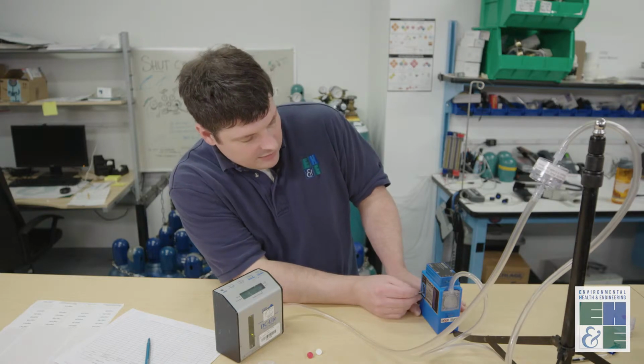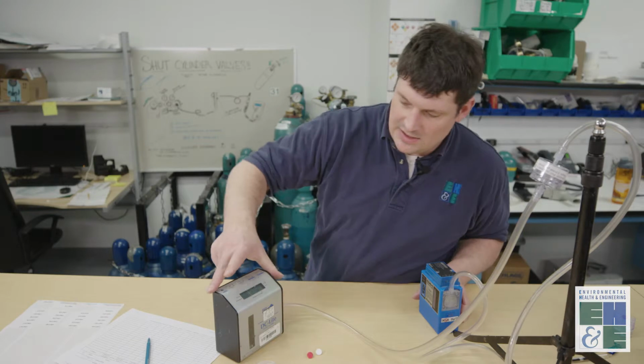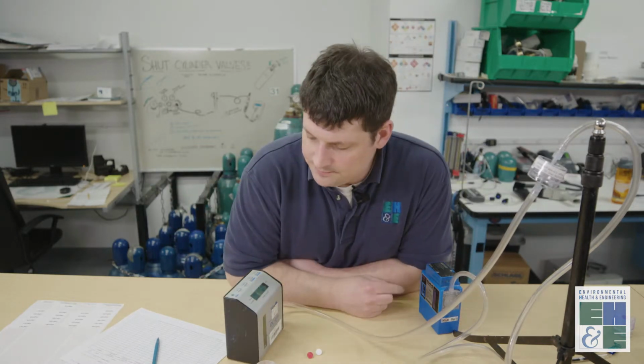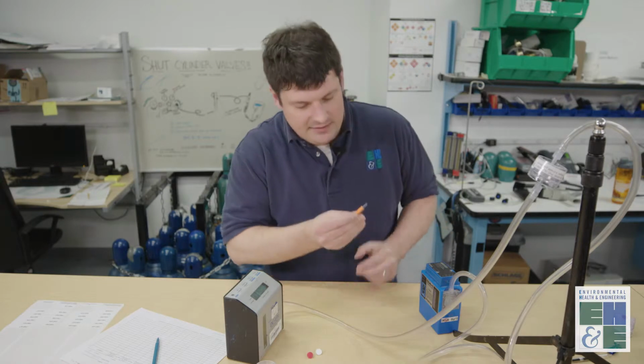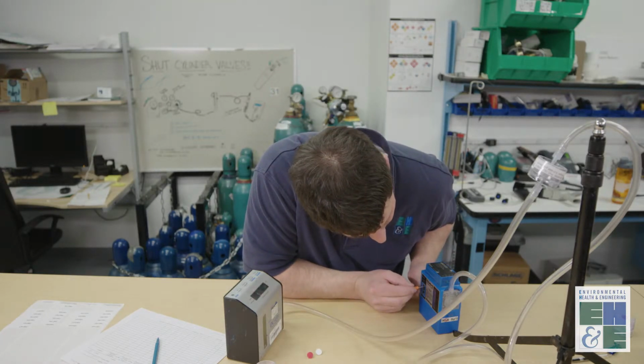So when I turn the pump on, it will flow, and I'll begin to take readings. I'm pretty close right now. I'm at 1.57. So I'm going to adjust it down slightly, going counterclockwise.